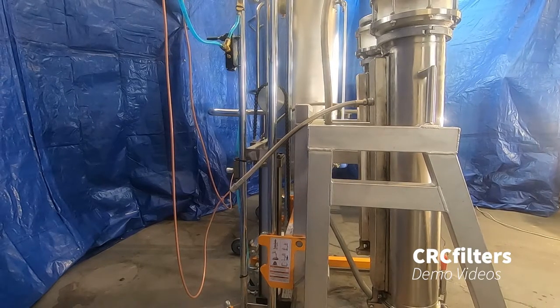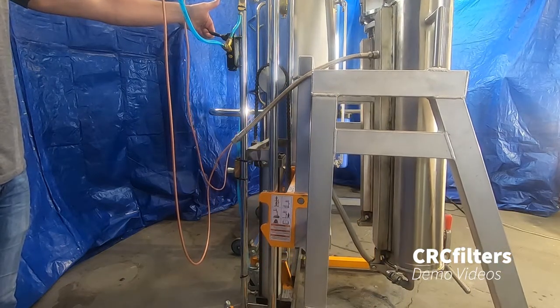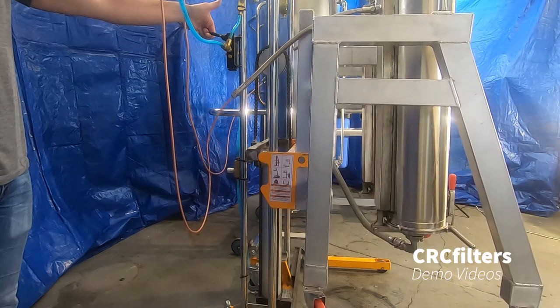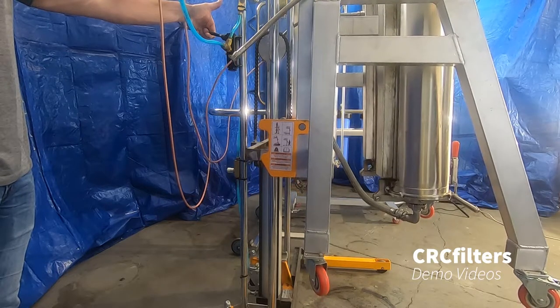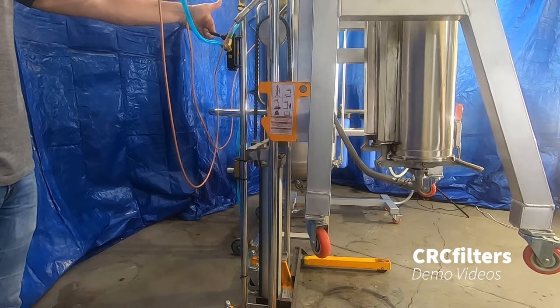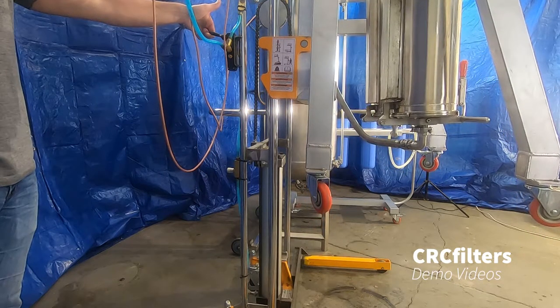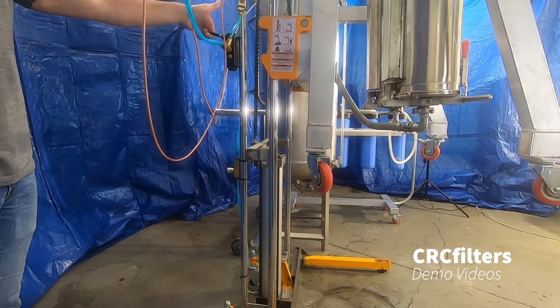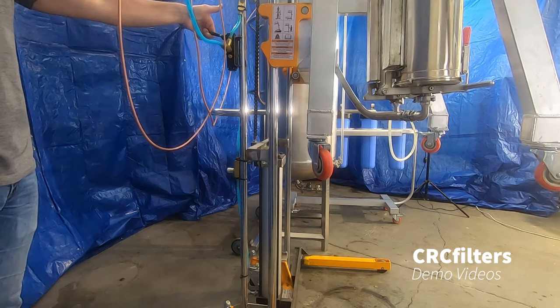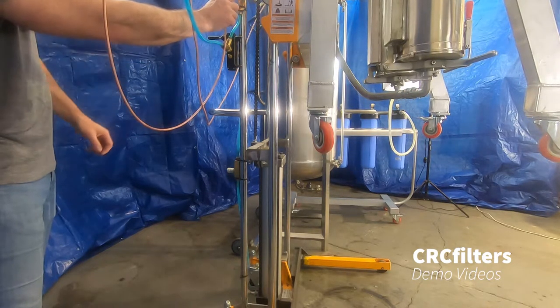I'll show you the lift real quick and how to unload these. Over here we have our up and down switch. This thing will get up high enough that you can get a 55-gallon garbage can or drum, or whatever — even if you use a super sack you can drop these columns into a super sack. You can also adjust the speed: there's a knob right here that adjusts the air flow and controls the speed.